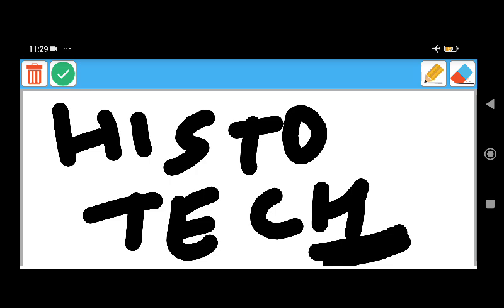The requirements for embedding are as follows. Paraffin wax is held at 2 to 4 degrees above its melting point. A cold plate is needed to rapidly cool the wax. An embedding mold in which to embed the tissue, and a base mold.